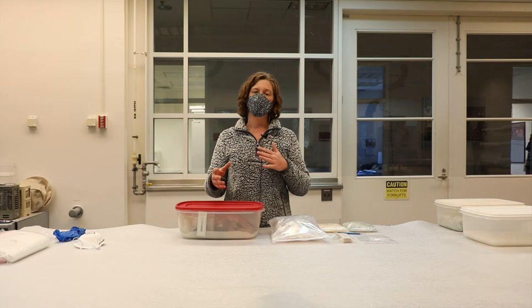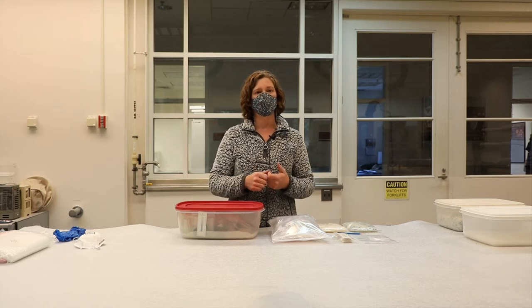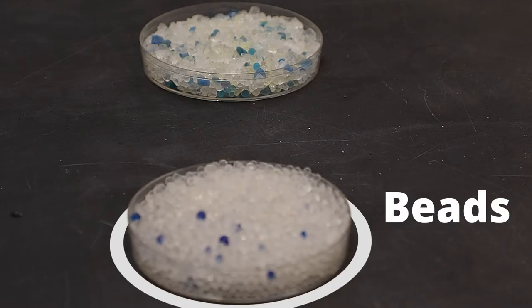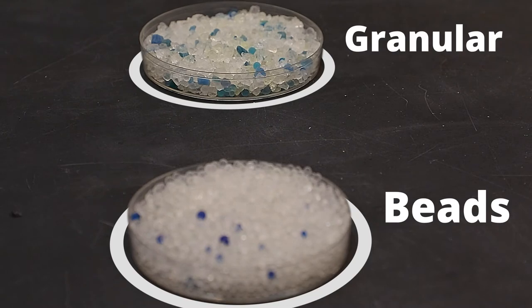Available to purchase either as cartridges or sachets, which are very convenient. However, loose silica gel is less expensive and more versatile. Loose silica gel is available in either a bead or a granular form, but here at the MAC Lab we prefer the bead form as it produces less dust.